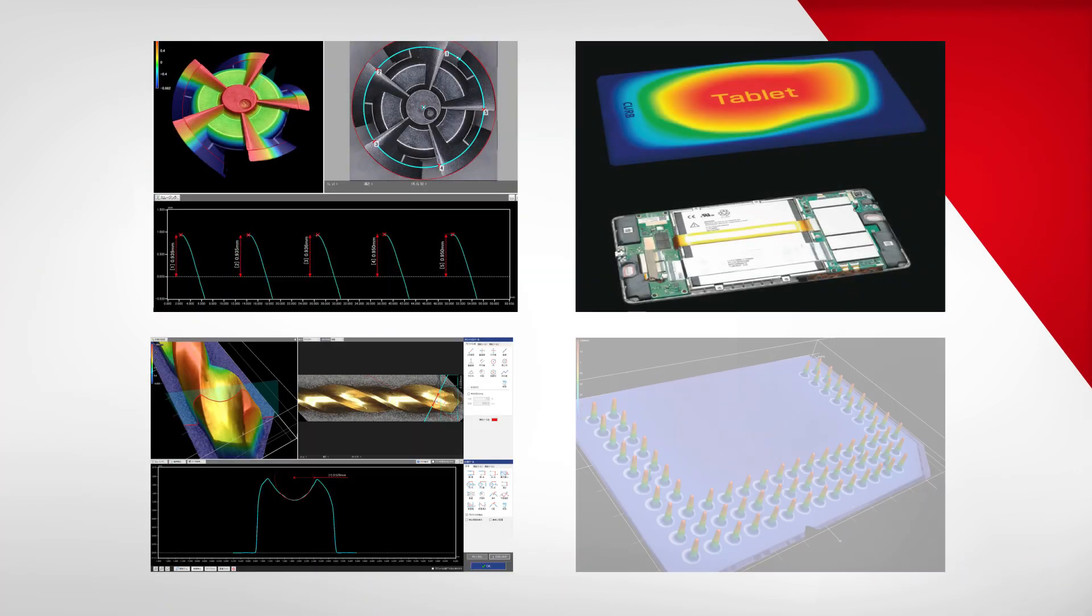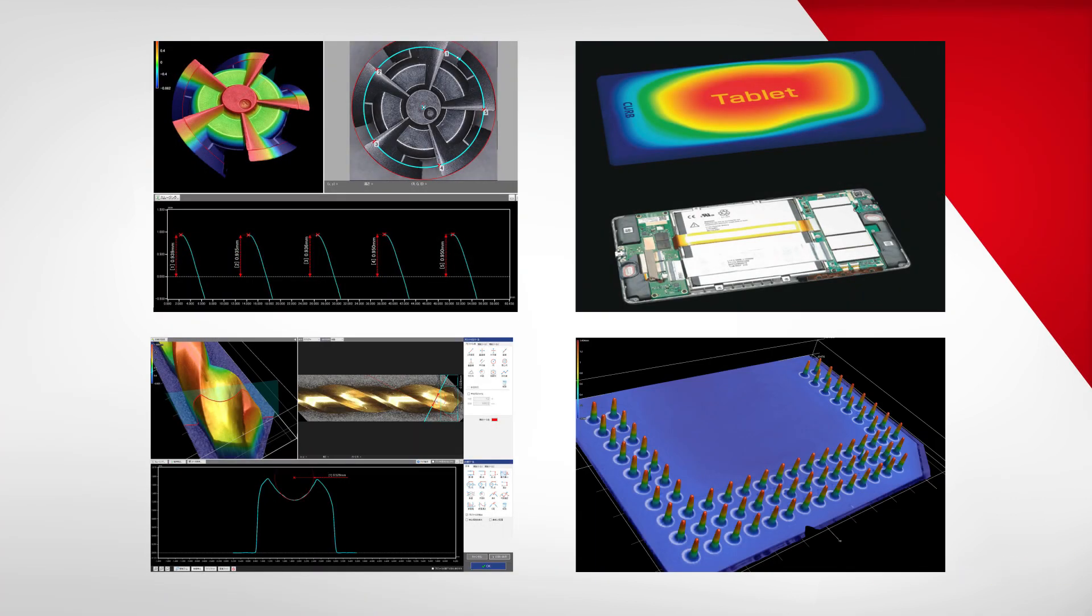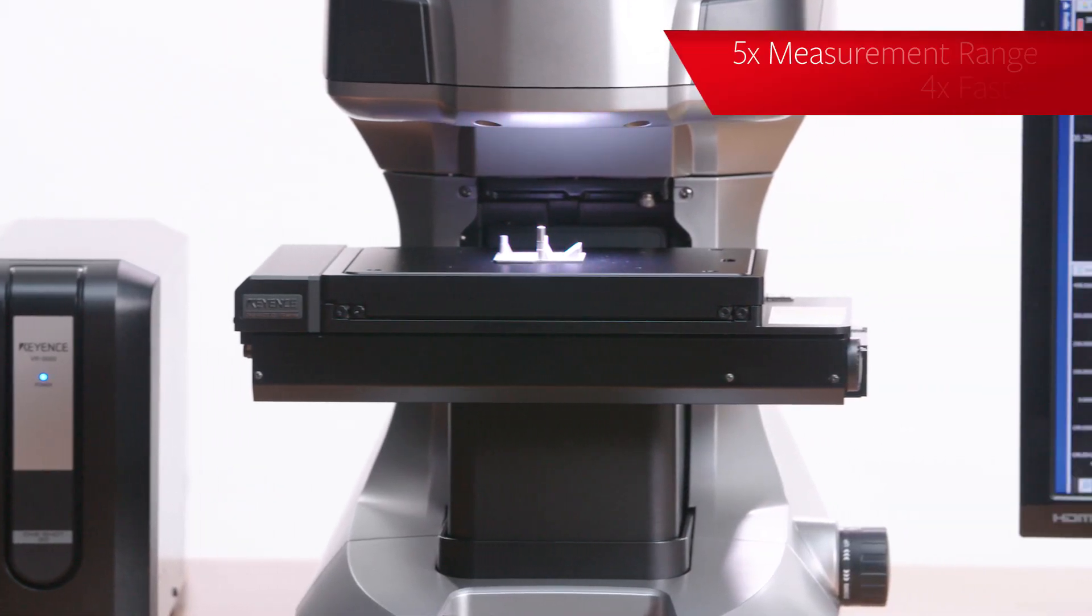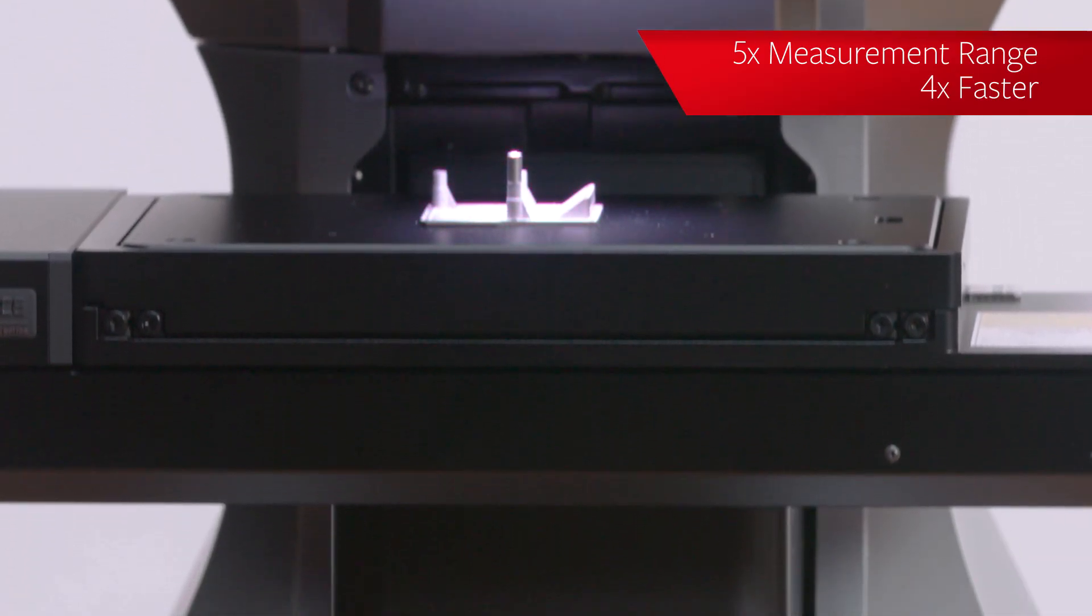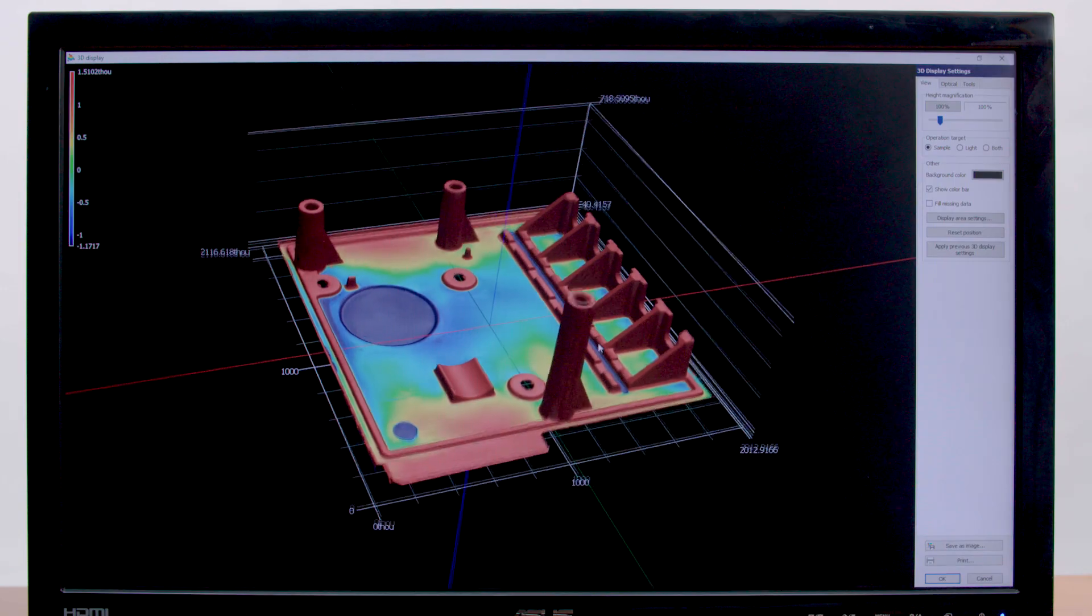Keyence has applied its success in sensors, optics, and signal processing to the metrology environment. The VR5000 is now able to scan five times the measurement range, four times faster, providing rapid 3D imaging and measurement with a single device.